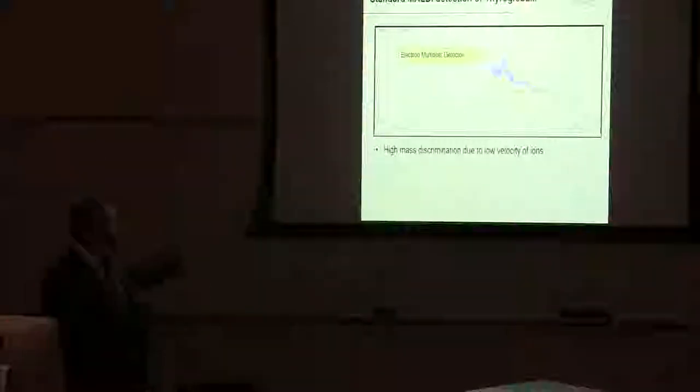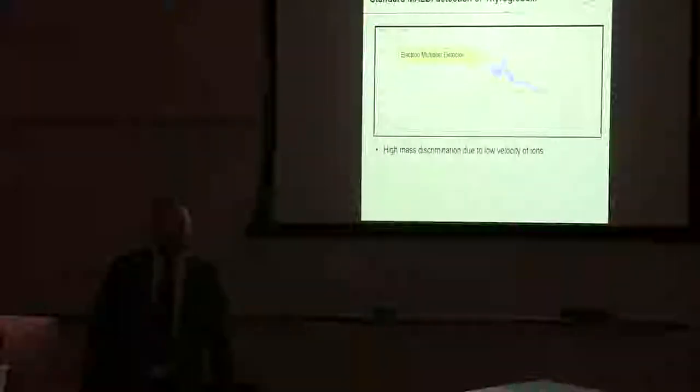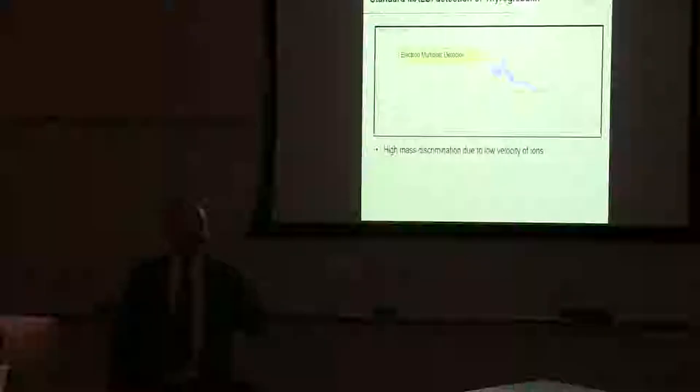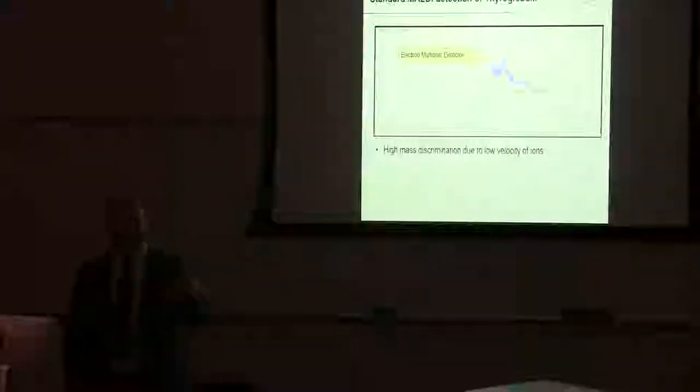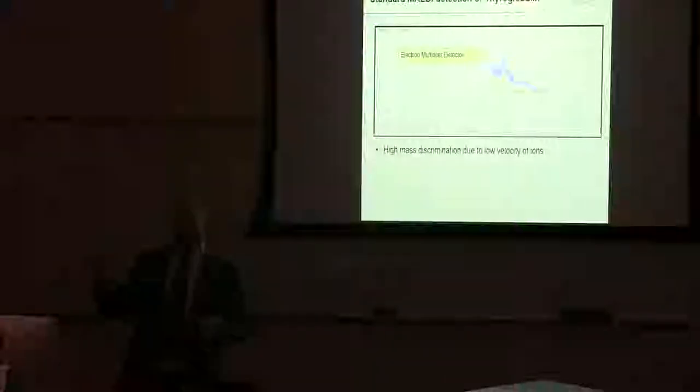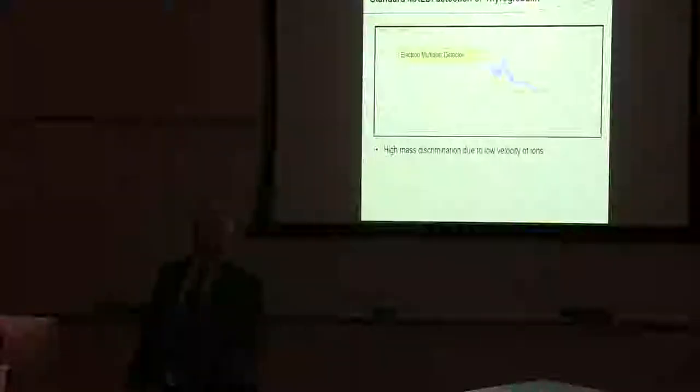So, this is an example of looking at high mass discrimination due to the low velocity of ions. So, when you're looking at high molecular weight species, as they're traveling down the flight path, the velocity, the impact on the detector is not so good. And as a result, you get very low sensitivity as you increase in molecular weight. So, that's going to affect the amount of sample that you need, and also the mass range that you can use to look at your sample. So, this is just using a simple electron multiplier detector.